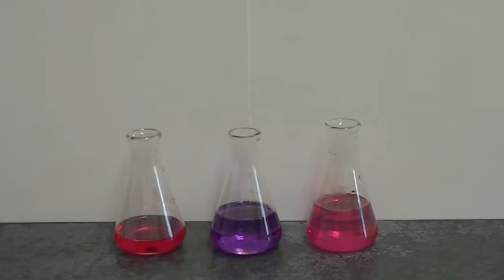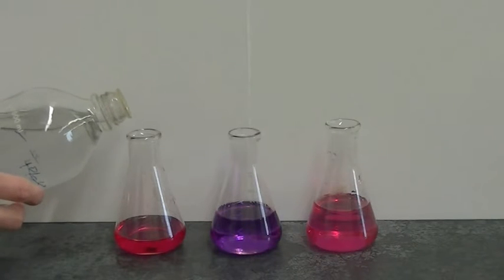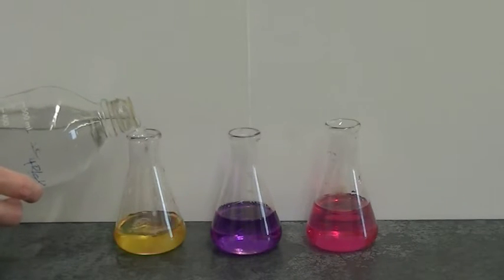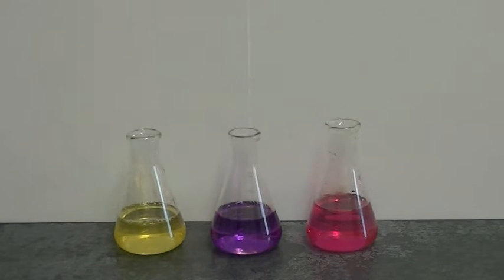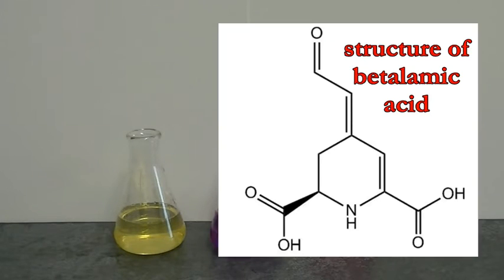However, that's if the pH doesn't get too high. In this case I'm going to add some one molar sodium hydroxide solution, and in that case we get a beautiful yellow color that's developed. The reason for the yellow color is that at high pH betanin is cleaved into the anionic form of betalamic acid, which is yellow in color.